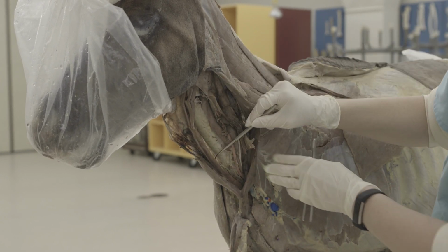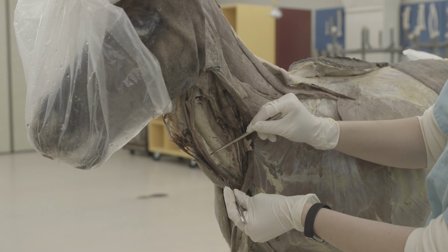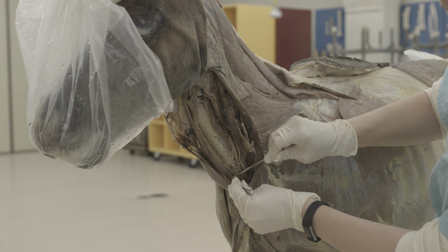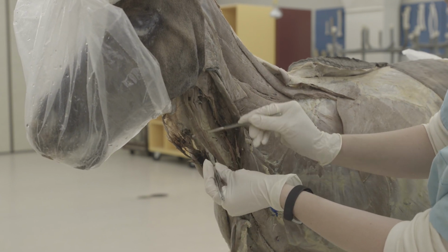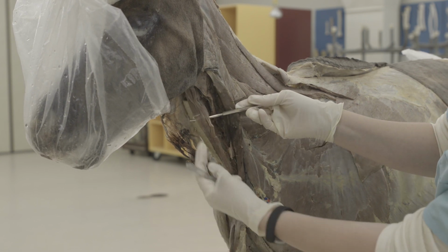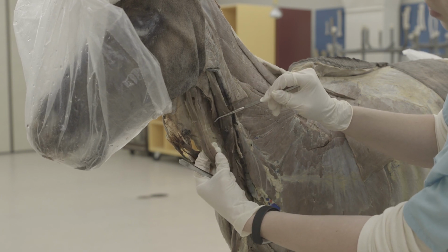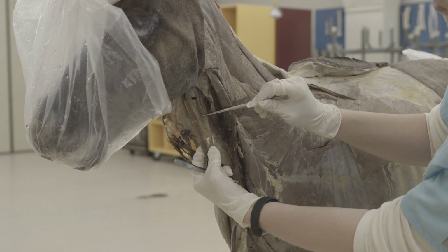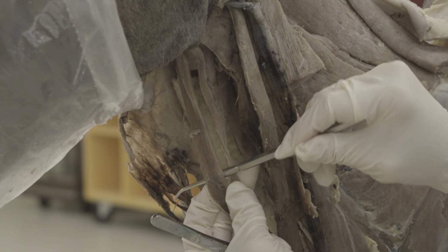And on that ventral midline, you'll be dissecting the sternohyoideus and sternothyroideus muscles. So they come from a combined origin on the sternum, so you can leave them combined up until they start to split apart when they get closer to the head. So sternohyoideus and sternothyroideus are together here, and you have both left and right sides. Here they split apart into the left side and the right side.